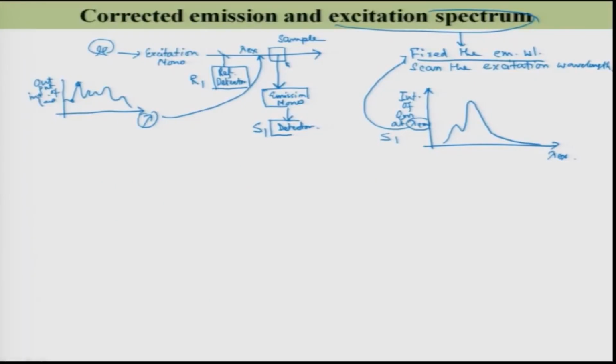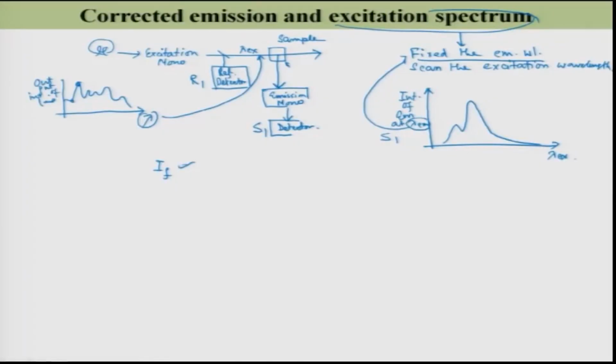It also depends on the absorption spectra, let me show. I said that the intensity of fluorescence is proportional to the intensity of excitation light and the concentration. If the concentration remains the same, then it is just proportional to the intensity of absorption.